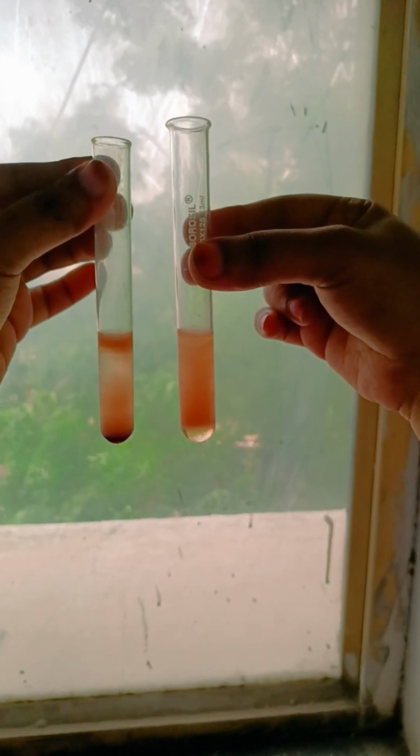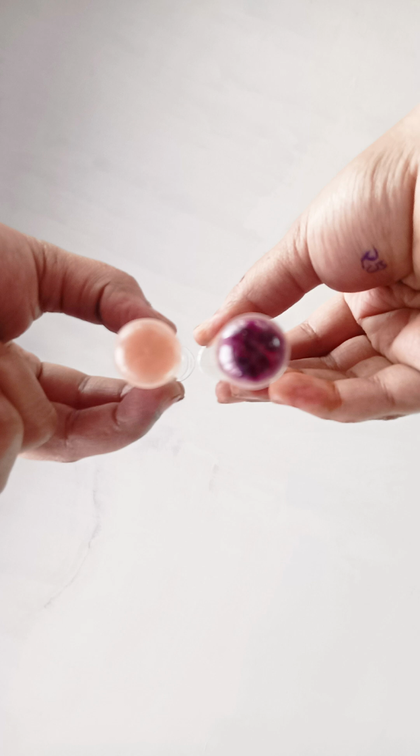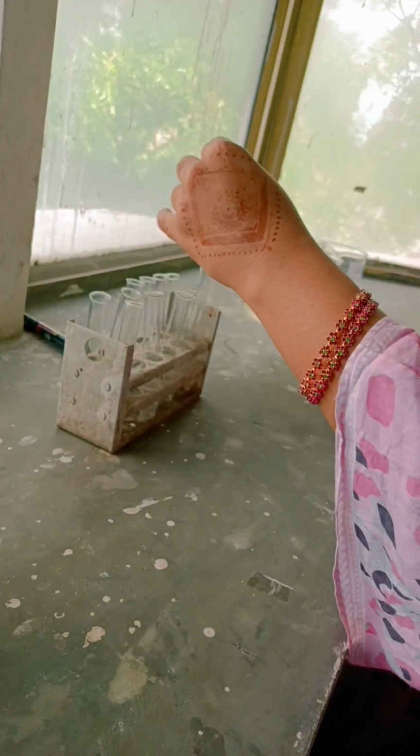And here you can see both the negative and positive ones. The right side one is positive and the other negative: the purple ring and the no purple ring formation.